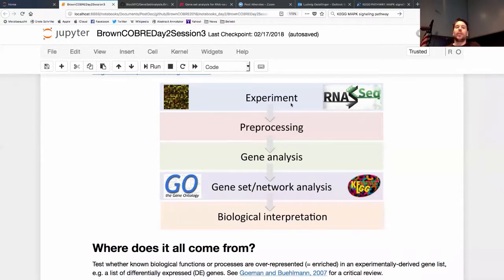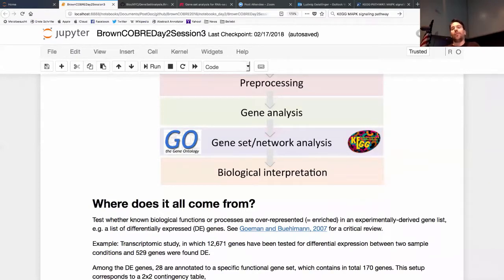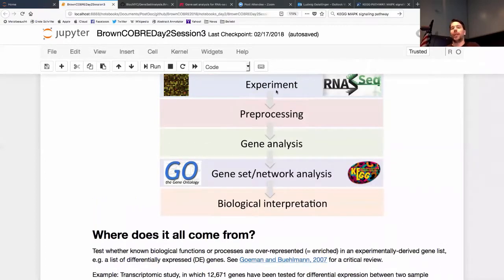So what I'm assuming here is that you're mostly familiar with high-throughput transcriptomic studies, you know a bit of normalization and also about differential expression analysis. I think we also had a workshop already here in the context of the Bioconductor meeting. So why do we do that? Well, if we find certain gene sets which are representing molecular functions or pathways enriched, it typically helps us a lot when it comes to biological interpretation of these high-throughput experiments. And in the best case, we might even be able to draw some conclusions on the phenotype that we are investigating here with these experiments, which could be a disease.